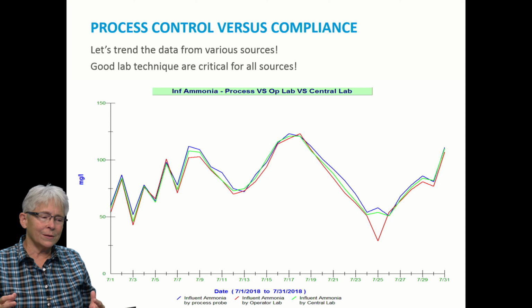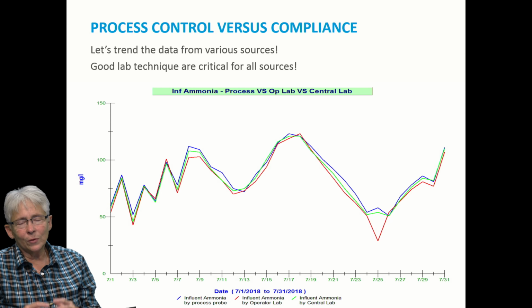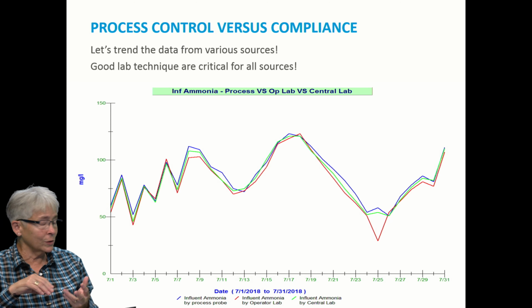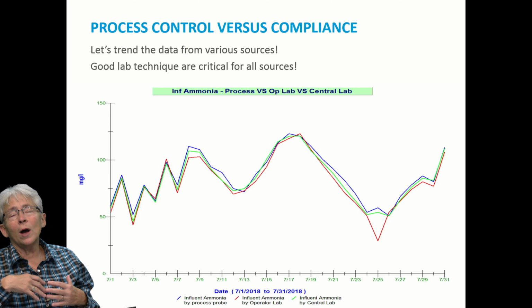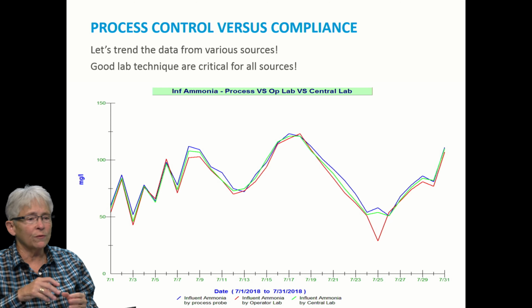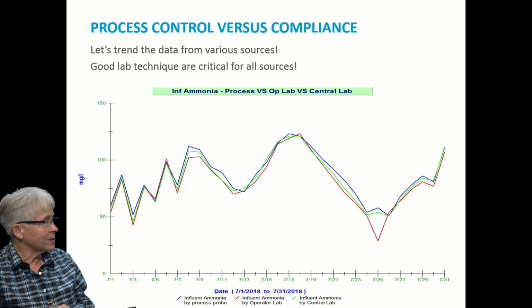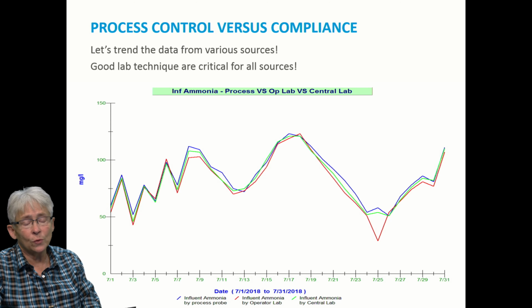Remember, we're trying to create an environment for our bugs to do their job. We're trying to get rid of phosphorus. We're trying to break down ammonias. But we have to create that environment within those basins. We can control DO, we can control solids, we can control pH. It's hard to control the bugs, so we control their environment. That's why we put in the basins dissolved oxygen probes, pH probes, solids probes, ammonia probes or analyzers, phosphorus analyzers, nitrogen analyzers, to really watch and improve those processes across the basin. We want to be conservative of energy, make sure we're using the right thing.